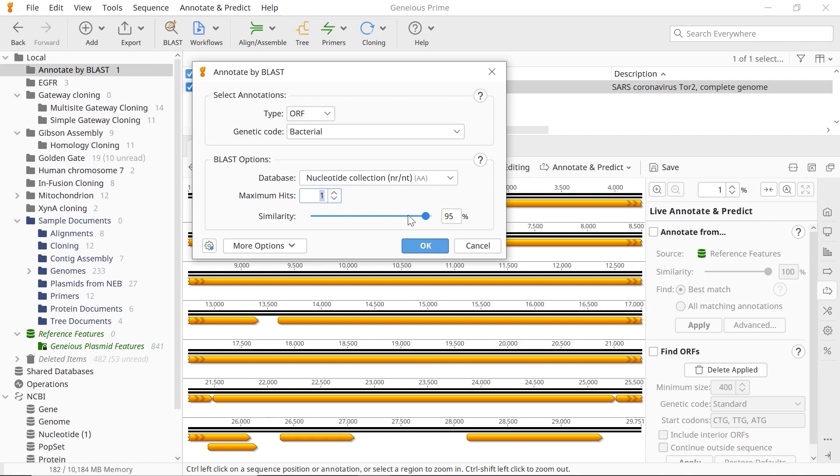If necessary, adjust the similarity slider to set the threshold for finding matches between your translated annotations and the BLAST hits.